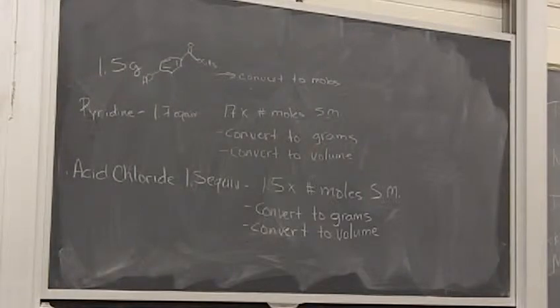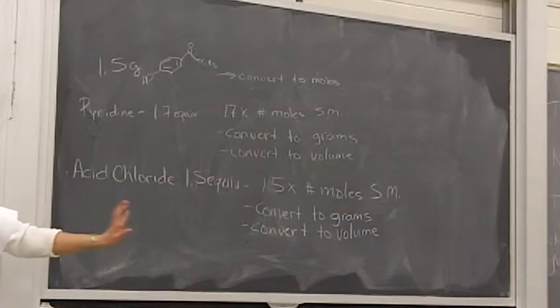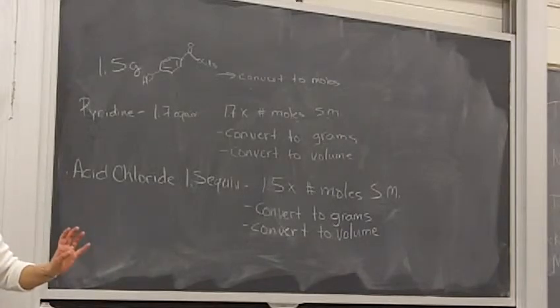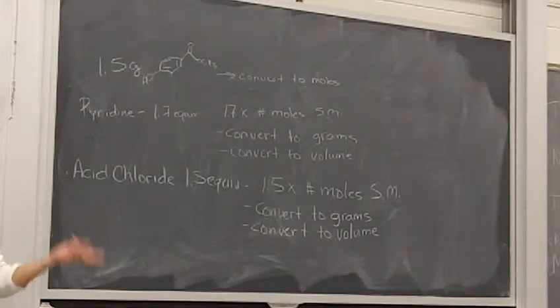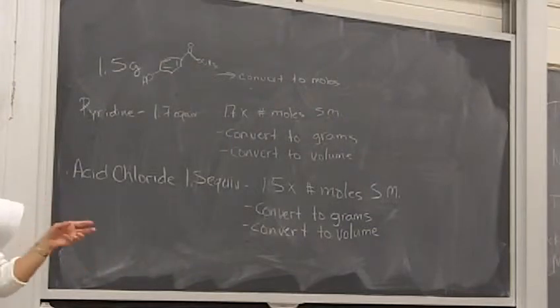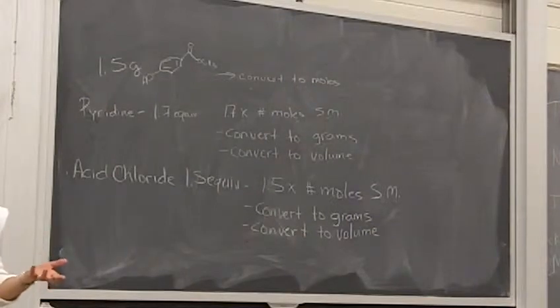The pyridine itself is going to have its own setup for dispensing. For the acid chlorides, when you go to get what you need out of the reagent hood, things are separated: acetyl and propionyl chloride separated from butyryl chloride, because there are separate things we need to take care of, because the butyryl chloride is so stinky, okay? So when you go to get your septa, your needles, your syringes that you need for setting up your reaction, keep in mind what acid chloride you're using, and grab from the right bin, okay? Same with after you clean things up, we need to keep things separate. So if you use acetyl or propionyl chloride, put it in the right container. If you use butyryl chloride, put it in the correct container, okay?